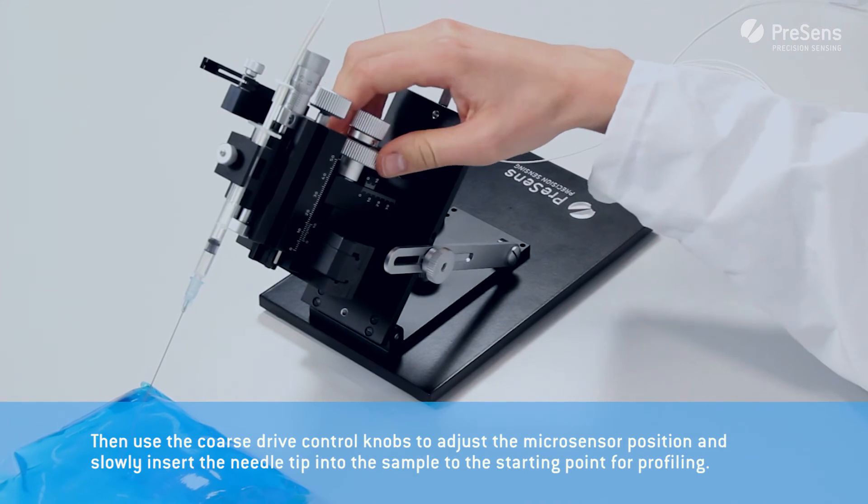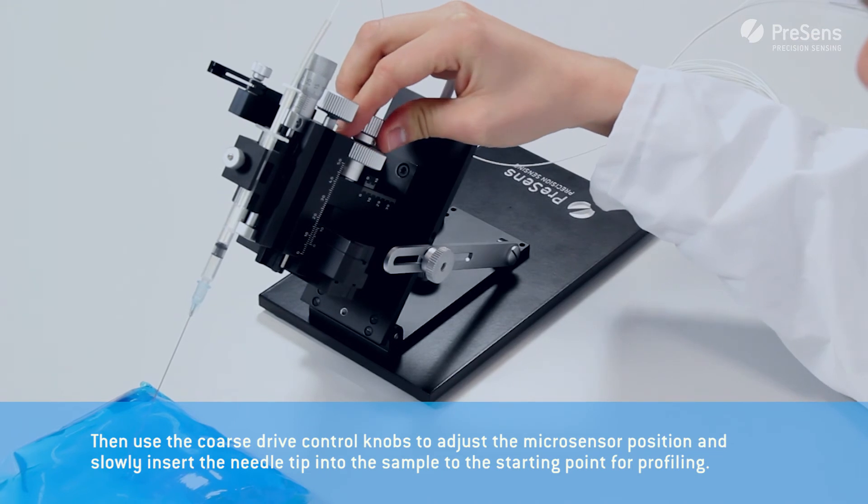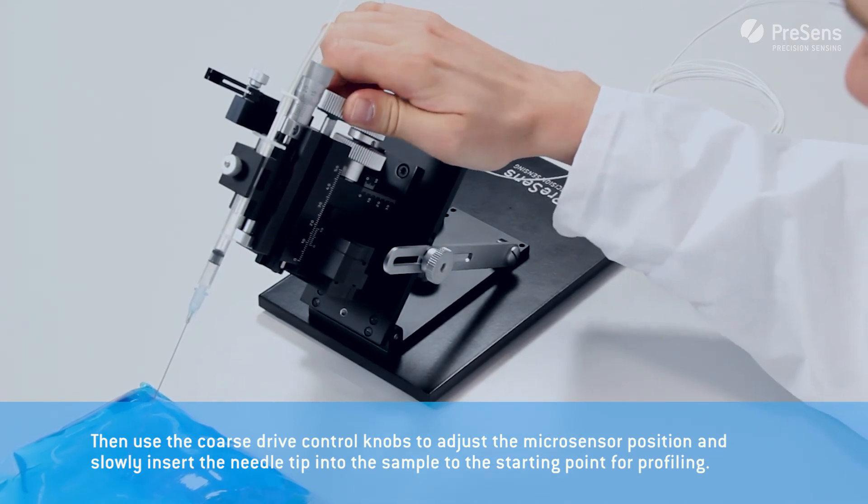Then use the coarse drive control knob to adjust the micro sensor position and slowly insert the needle tip into the sample to the starting point for profiling.